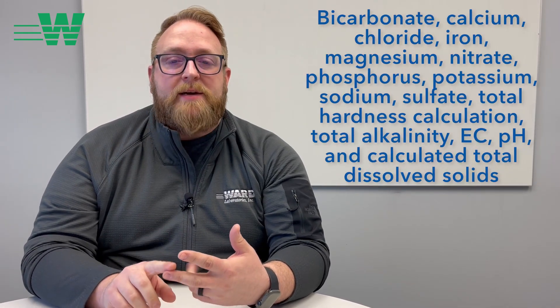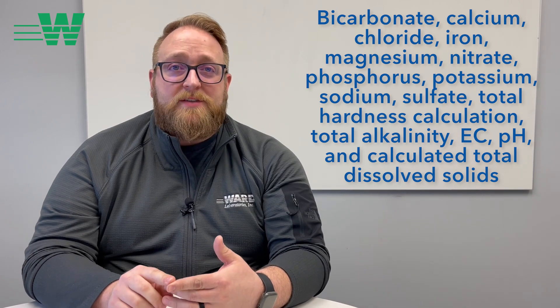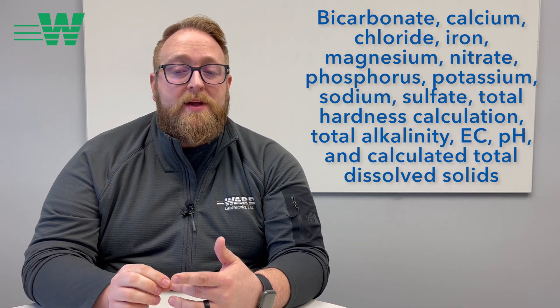Secondly, our Brewers Water Kit offers a pretty substantial amount of information. You get bicarbonate, calcium, chloride, iron, magnesium, nitrate, phosphorus, potassium, and sodium.